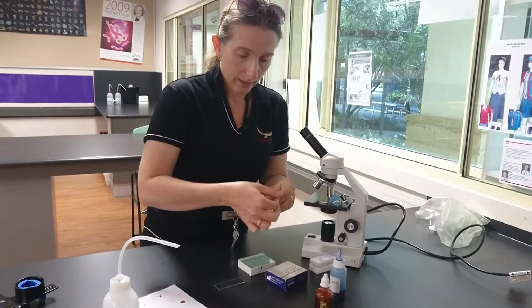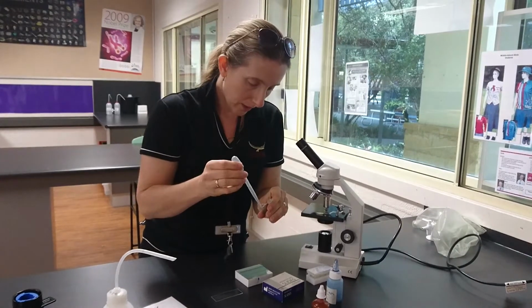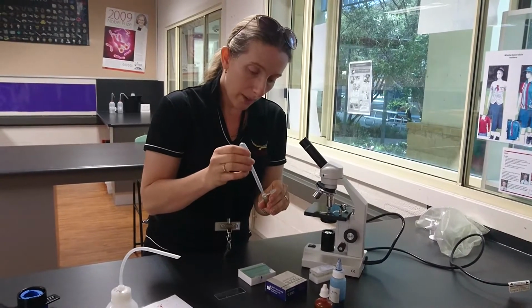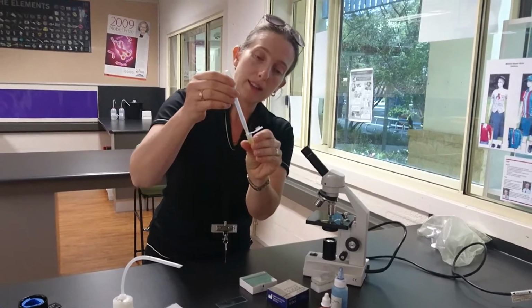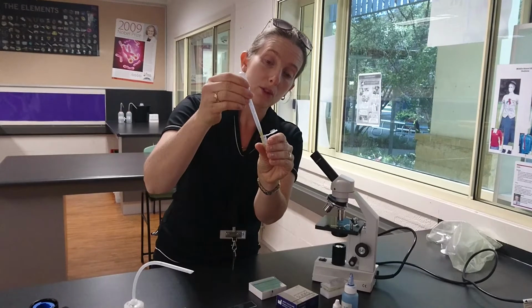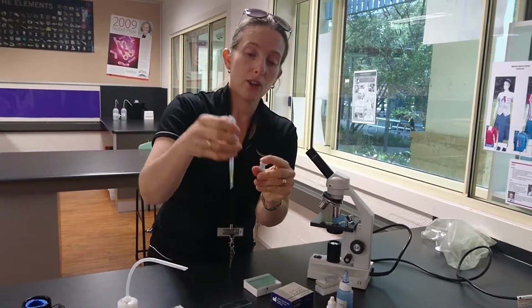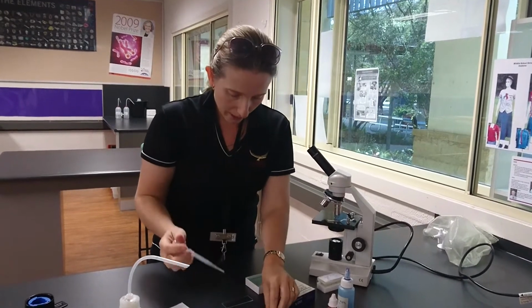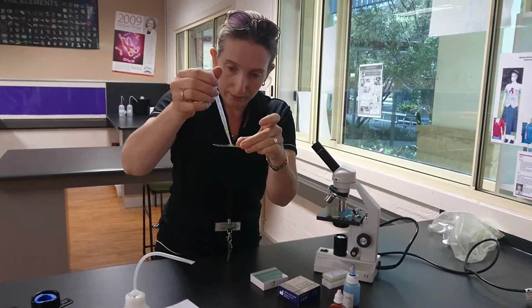To make the slide, you then take one of these pipettes, just take a drop out of here. Now if it's not mixed up well, you can do this with your pipette to help mix it up a bit more. Some of them don't mix up very well with shaking. Take a little drop, close your lid here so it doesn't go everywhere, and put one drop on your slide, like that.